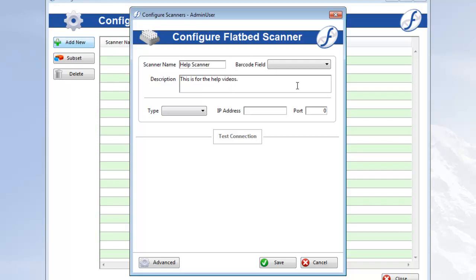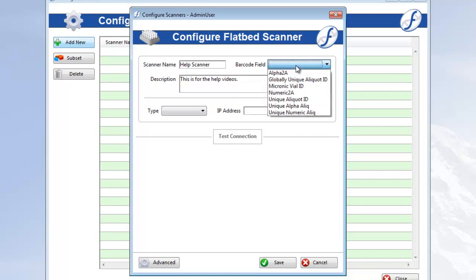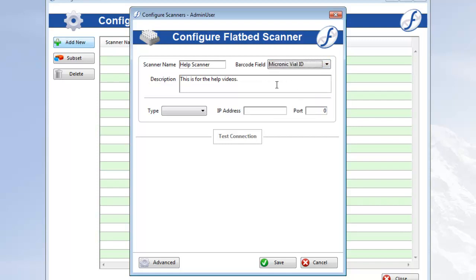Next, we'll select the barcode field, which is the field that will be used to match the IDs scanned by this scanner. Needless to say, only unique aliquot fields are available in this dropdown. At the time of scanning, when you select the scanner, the field you choose here will automatically be selected for scanning, but you can always change it at that time as well.